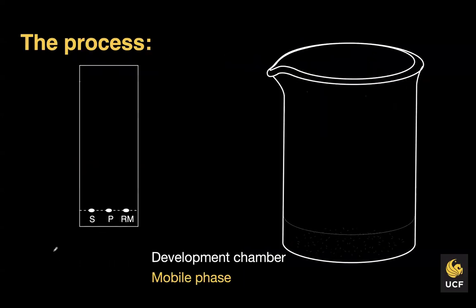All right. So how does the process really take place? As you saw in the video, we take the TLC plate, we draw 1 centimeter from the bottom, and then we spot the TLC plate with whatever we need to spot it with. In this case, while the reaction was still on ice and taking place, we weren't sure if all of the reactant was converted into product.